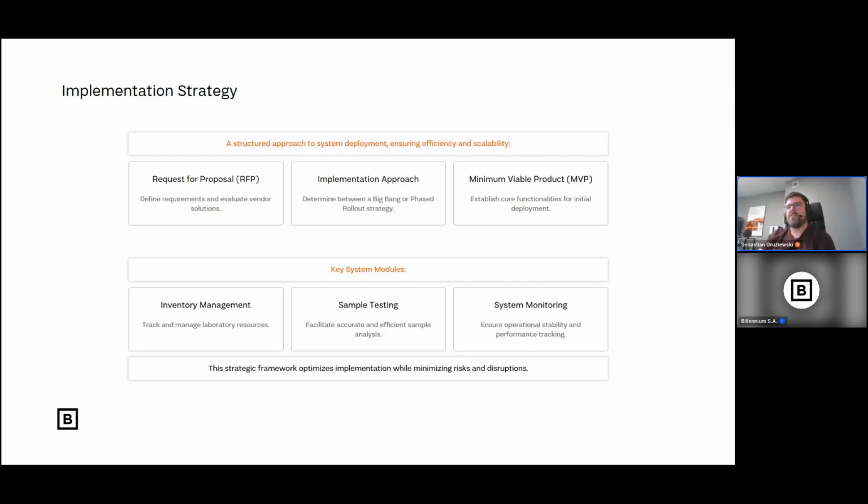We invite our vendors to show their software and basically perform some kind of a gap analysis to see what fits our needs best, because there are many different LES systems, ELN systems, LIMS systems. They are totally different. They have some similarities, but we have, for example, LES systems that are still based mainly on Excel with some additional macros that help it work still somehow.